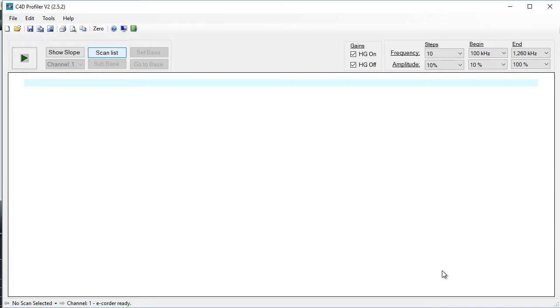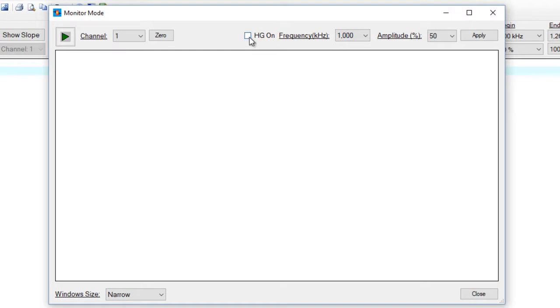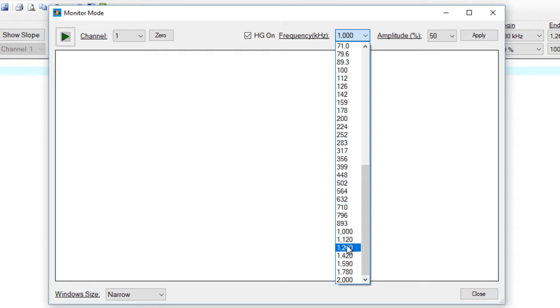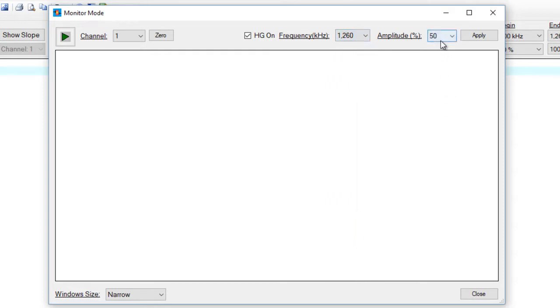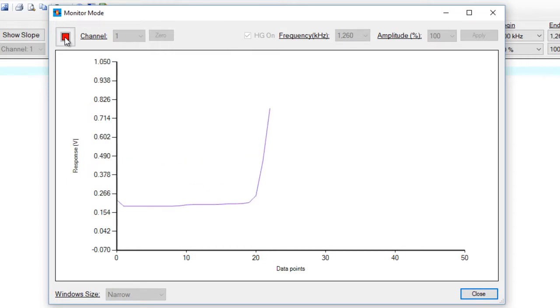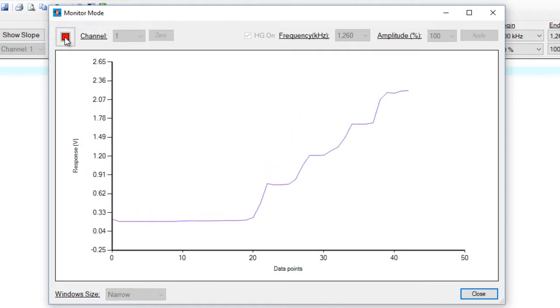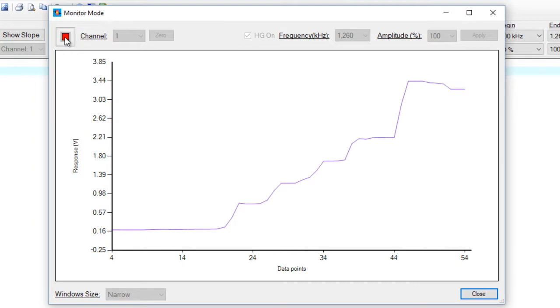You have to run the C4D profiler with your background electrolyte in the capillary. You can monitor that by going to Tools, Monitor Window, and setting up the maximum settings: the head stage gain on, a frequency of about 1200 kHz, and 100% amplitude. You can click Apply and Run. We can now inject our background electrolyte into the capillary. There you can see it's injected.